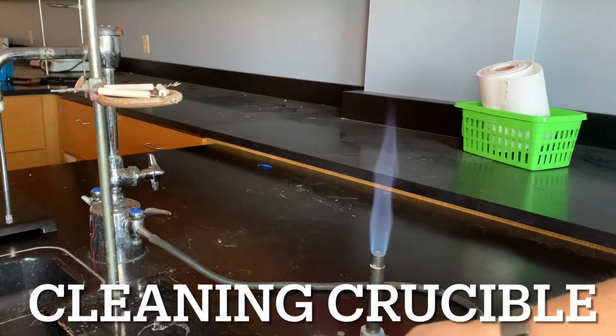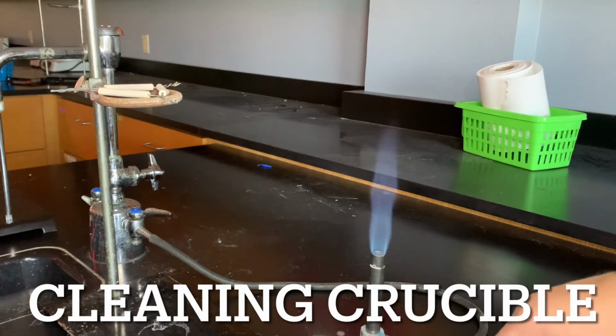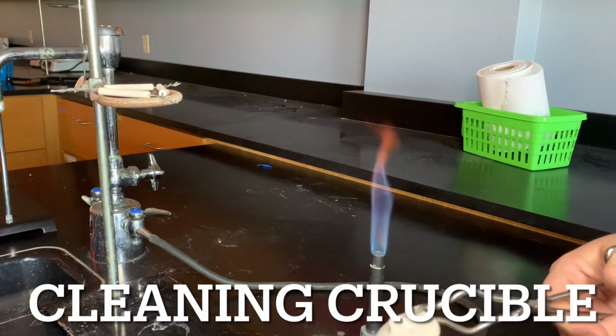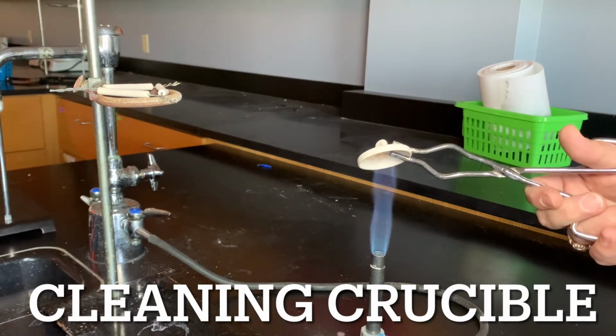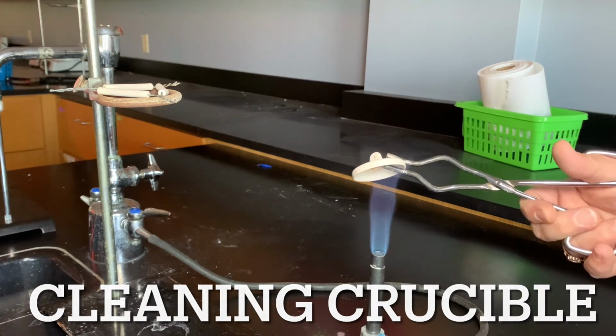So this may take a little bit. But notice I'm going to turn it over like this. If you don't feel very confident with that, you can always do this for the heating process. And we're going to simply stick it in there. The lids only need to go for about 2 minutes.